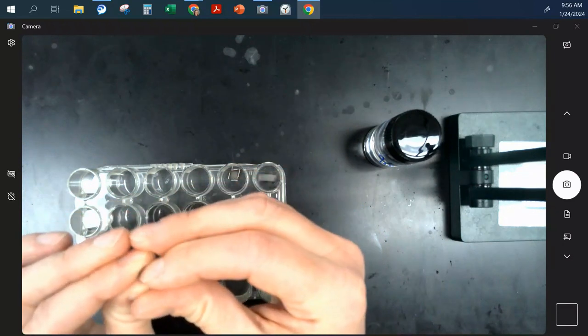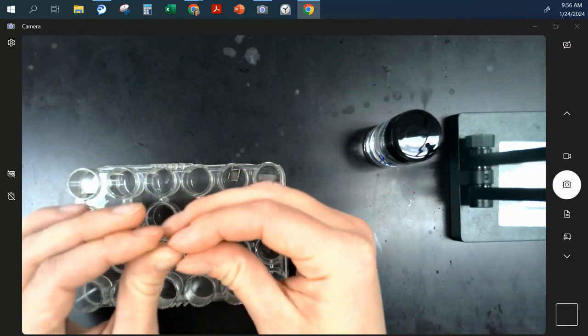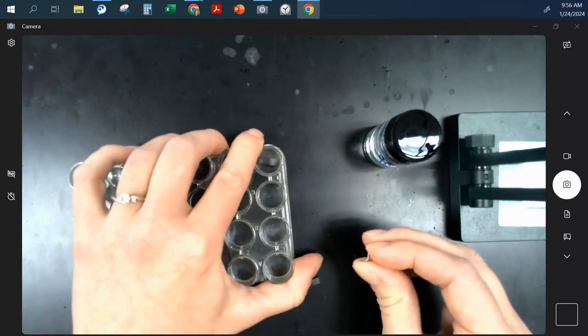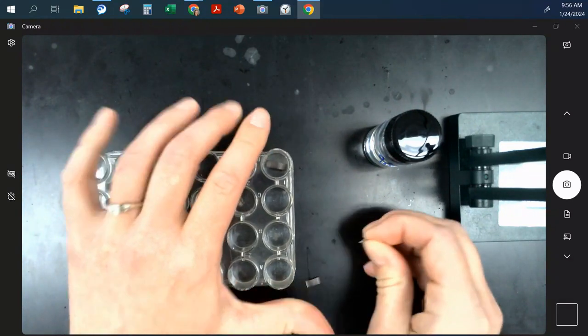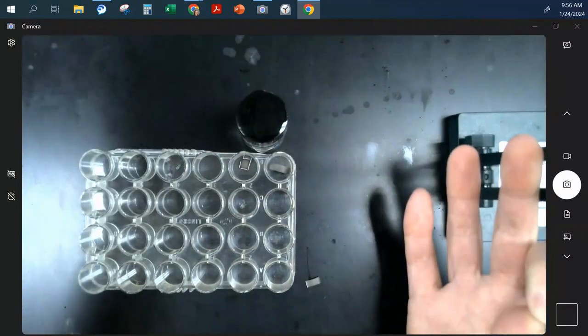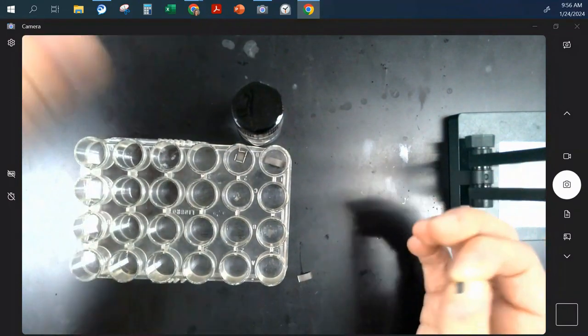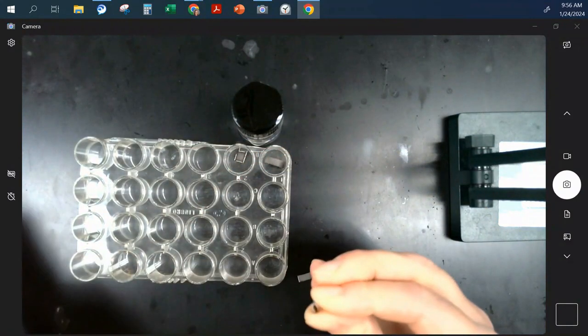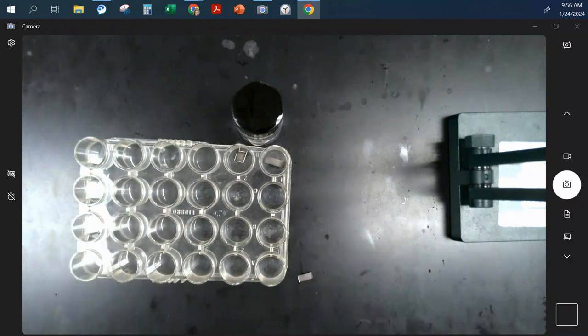So there's a few different ways that I can change the temperature of my reaction. I could put the whole well plate on ice, and that could change my temperature. There's a whole bunch of different ways that you can do this. If you need something, let me know. So I'm going to bring ice. We will have hot water. This tap water gets almost to 40 degrees Celsius, so it gets quite warm. So you could change the temperature with the water.